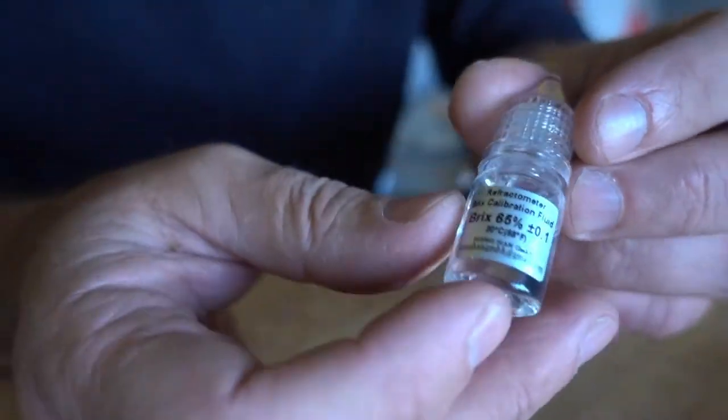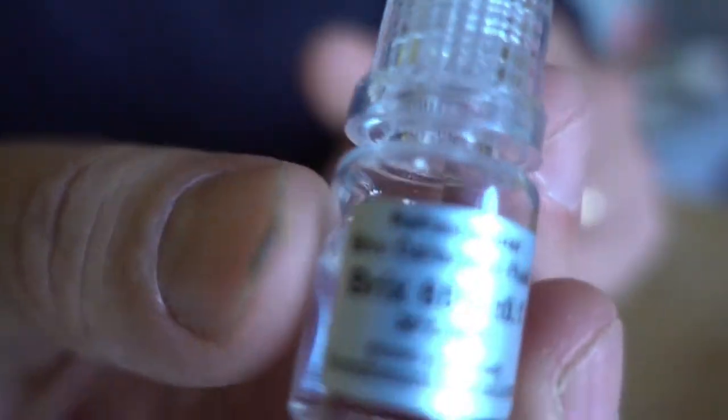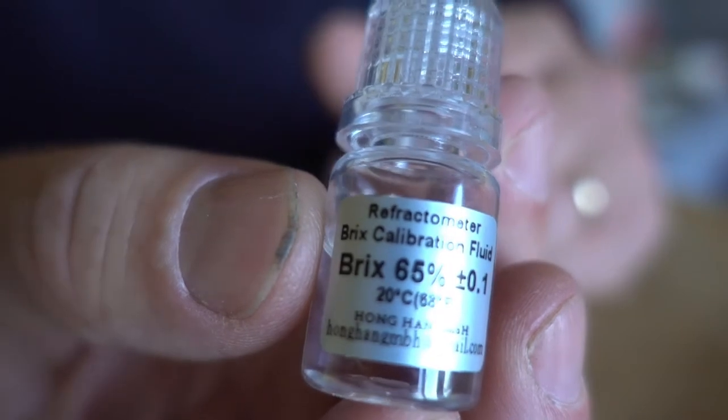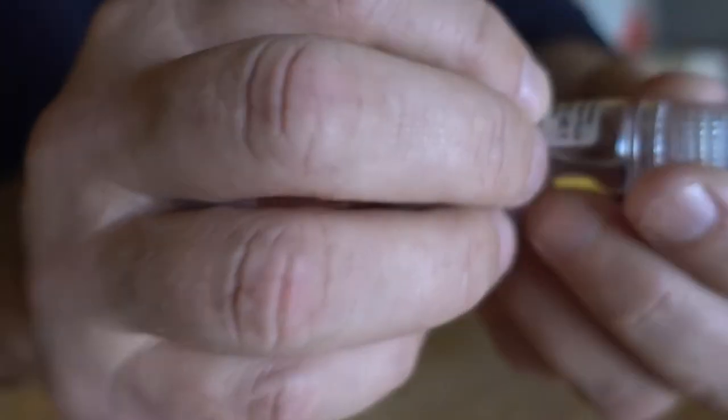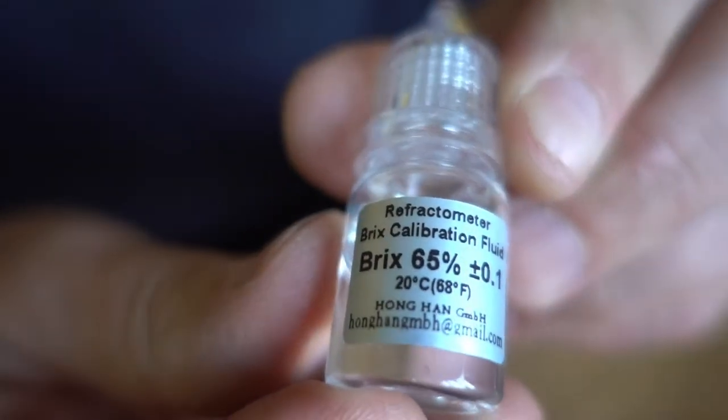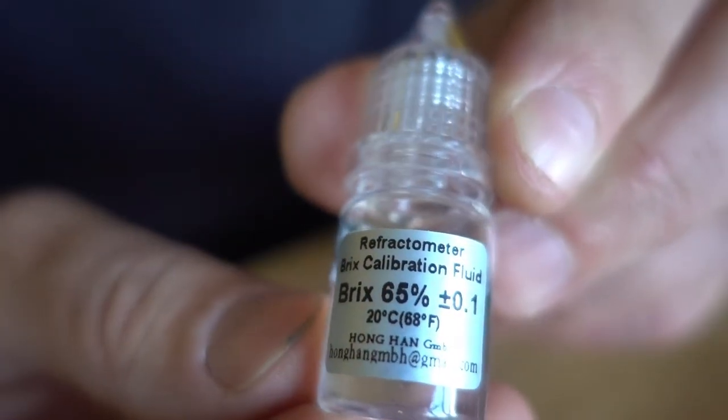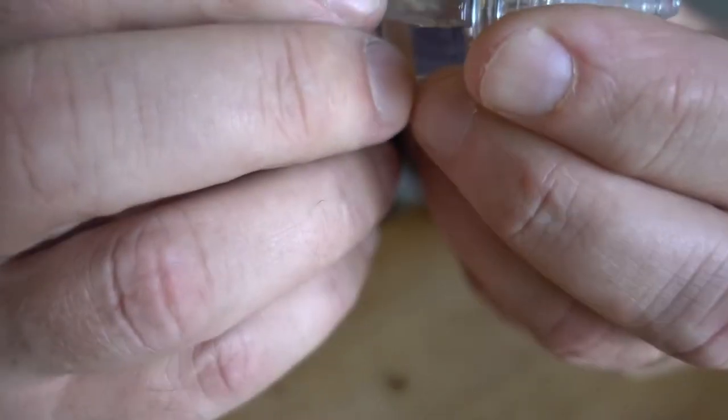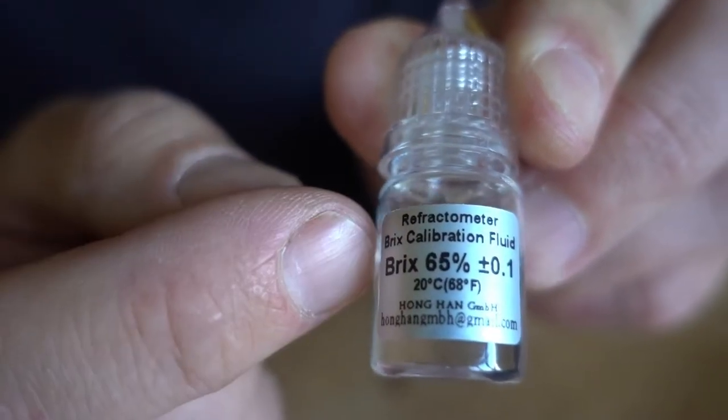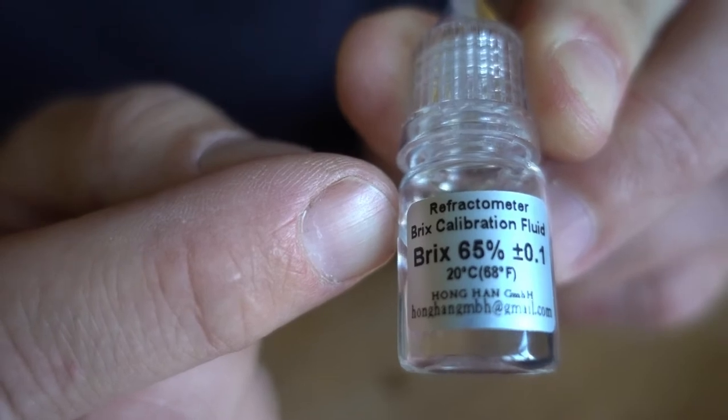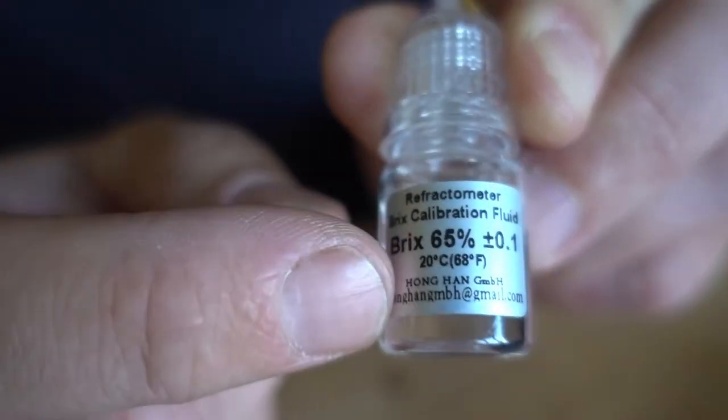Some refractometers come with a little bottle of fluid called calibration fluid and this one says bricks 65 percent plus or minus 0.1. So if you get a 65 percent bricks reading, I still don't know what bricks means, then you've got an accurate reading.